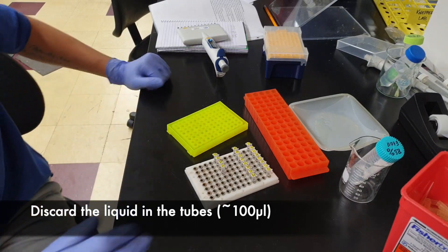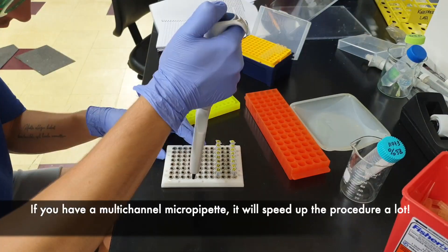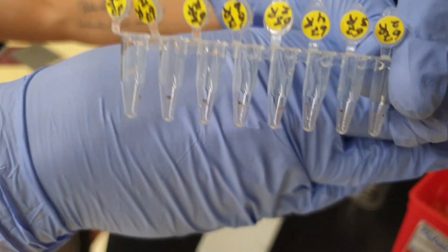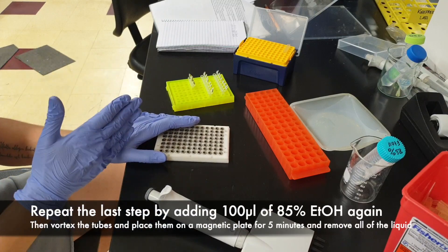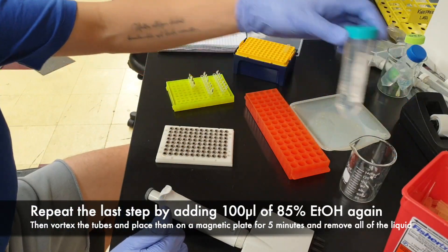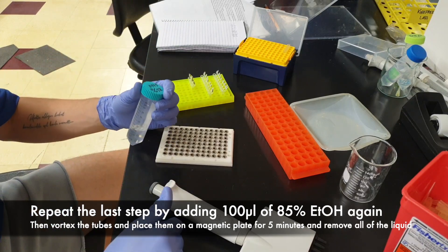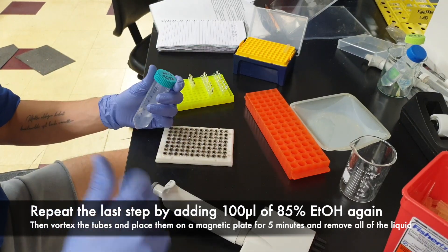Next step — remove the ethanol inside the tubes. This looks good as well. We're going to repeat the process we just did: adding 100 microliters of 85% ethanol into each tube, putting it on the magnetic plates again, and then removing all of the liquid.